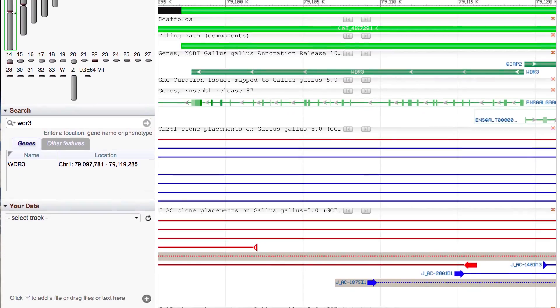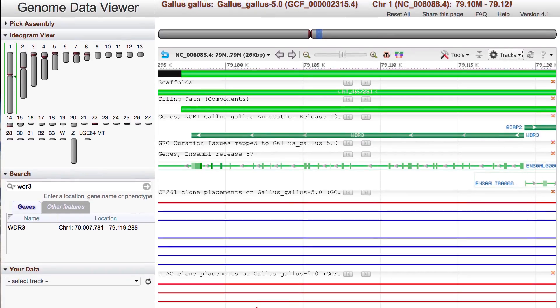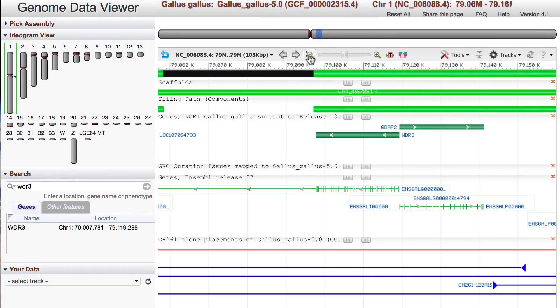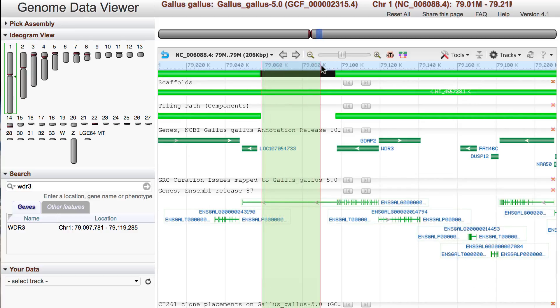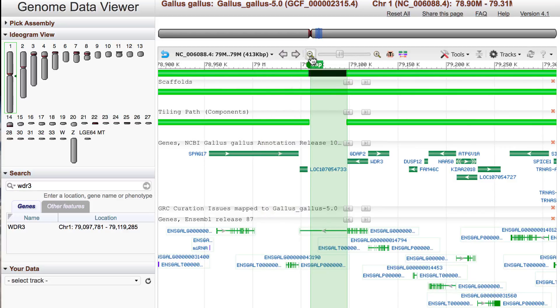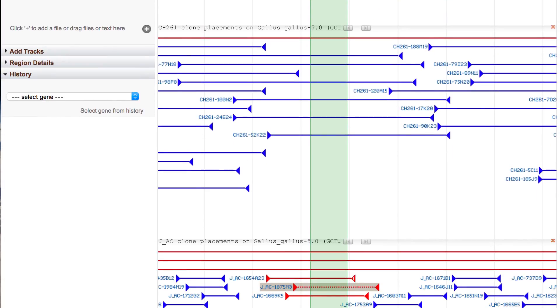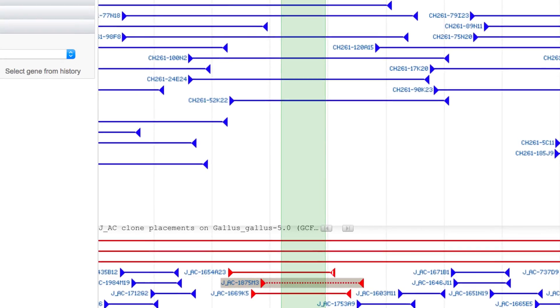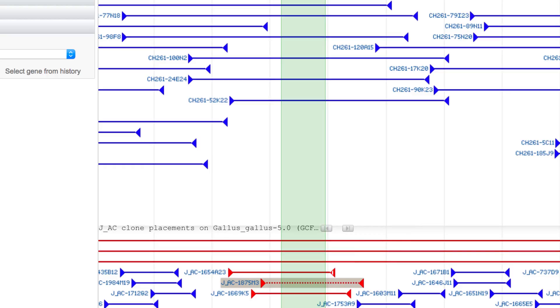You can also upload other data, such as one of the GFF files on the CloneDB FTP site. I'll adjust the zoom to see both gene models and the assembly gap, and add a marker for the gap region. Clones with unique concordant placements are displayed as solid blue lines — for example, here is that CH261 clone we looked at earlier. Unique discordant clones display as a solid red line, and multiple discordant clones display as a dotted red line. This clone also has a gray background, indicating that not all end sequences associated with the clone support this placement. If your goal is to find clones with unique concordant placements that contain this assembly gap, several are seen here.